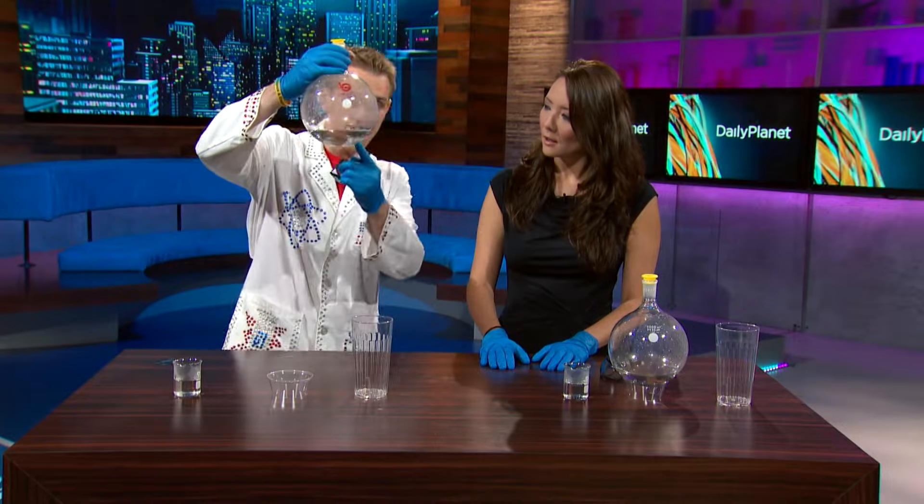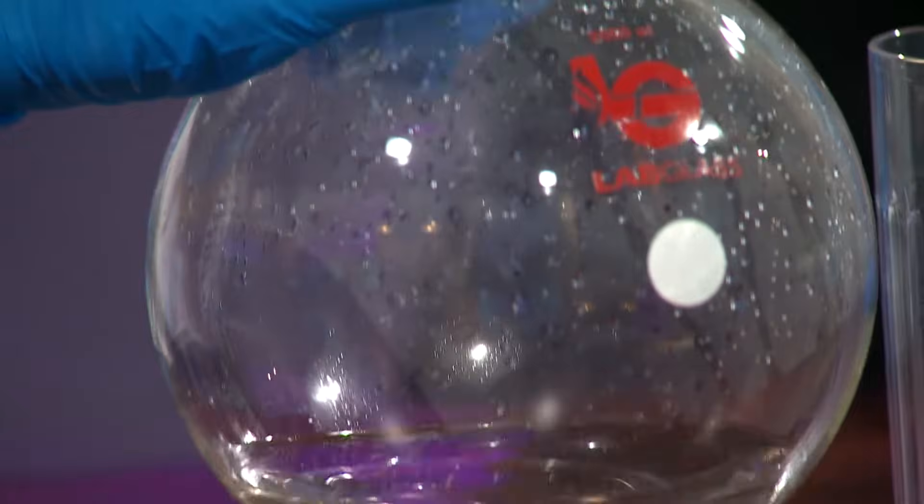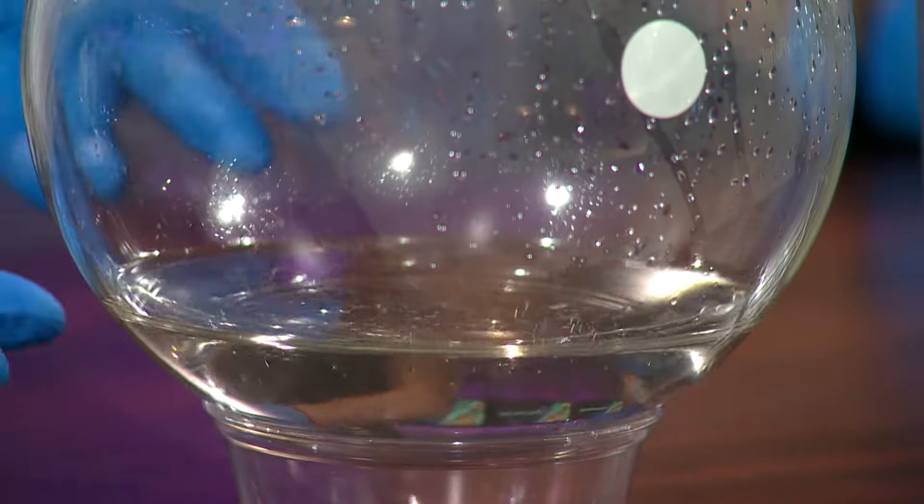We're doing it using just two liquids. We already have silver here — this clear liquid is the silver, it's silver ions, which is silver dissolved in water. Elements can have different forms: they can be charged and dissolve in water, like the silver here, and then we have to change it to its solid form to make the mirror.